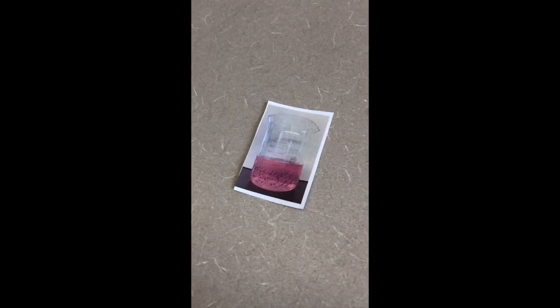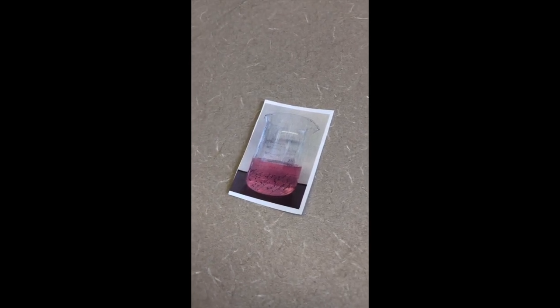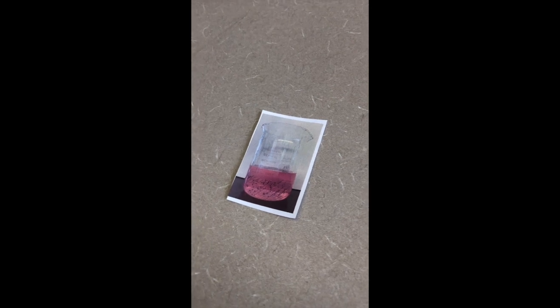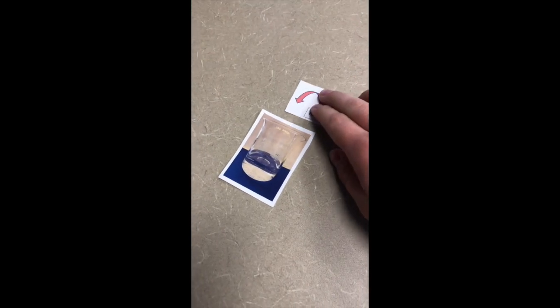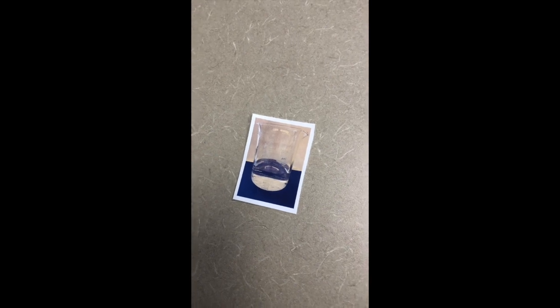So after a long length of time, we have crystals now. So now all we have to do is take this mixture and suction filtrate it, collect our crystals, and let them dry off. Here we have our organic layer, and we mix some HCl to make the quinuclidine gain a hydrogen to give it the charge and therefore be in the water layer. And then we mix it. Now that we've mixed the HCl with the organic layer, we then pour it back into the separatory funnel.